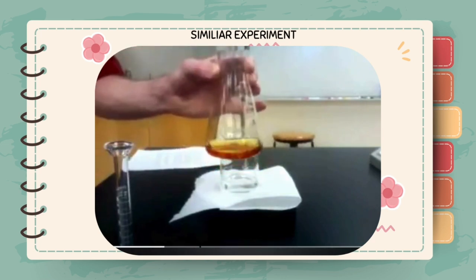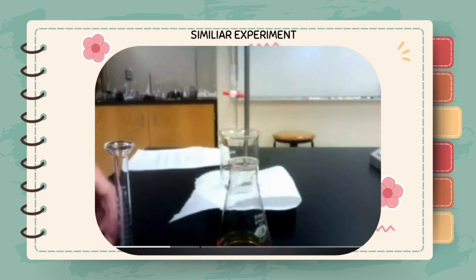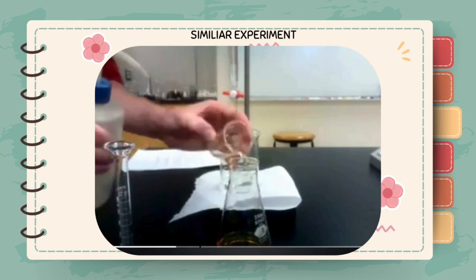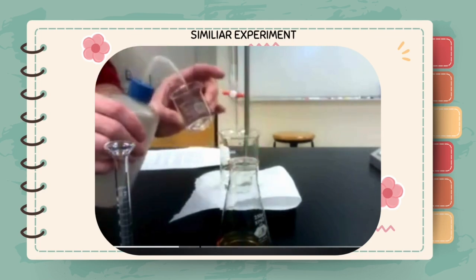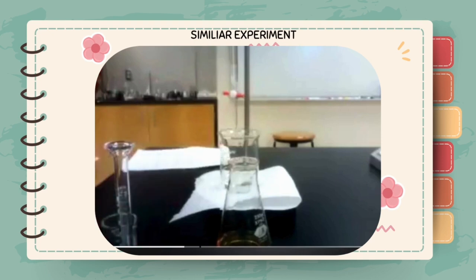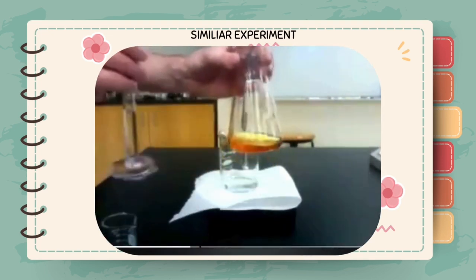If you have prepared your reagents in a beaker as I have shown, you will need to quantitatively transfer the solution. Therefore, you will need to rinse out your beaker and transfer the remaining reagents into the flask. You will now let the reaction proceed for approximately 5 minutes. In this time, prepare your hydrochloric acid to be able to quench the reaction when the timing is done.